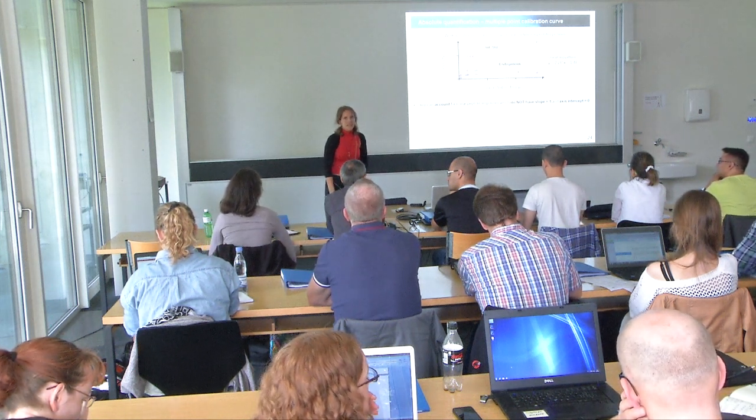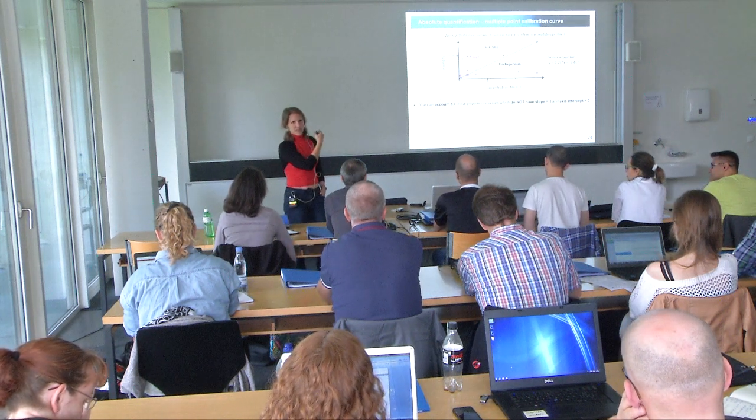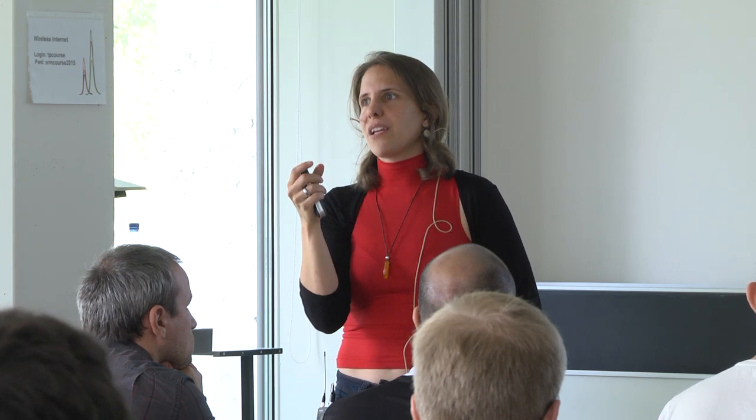Yeah, I mean, it depends on the concentration. For sure, if you have high intense background interference. But sometimes, if your endogenous peptide is high as well, and you spike in your peptide at a high concentration, you will not necessarily see that there are some interferences at the lower end. So just by looking at the chromatogram, doesn't necessarily mean that you will be able to spot issues when you just work with the single point calibration.